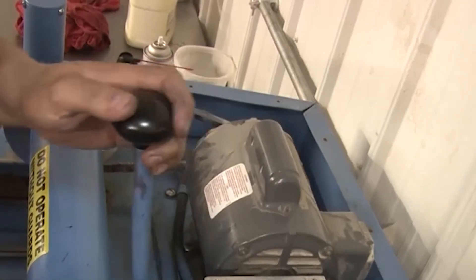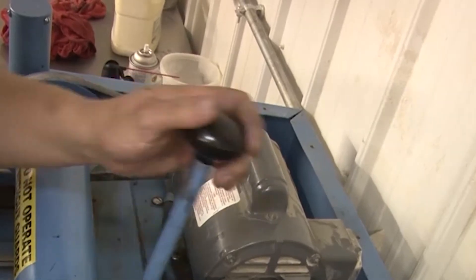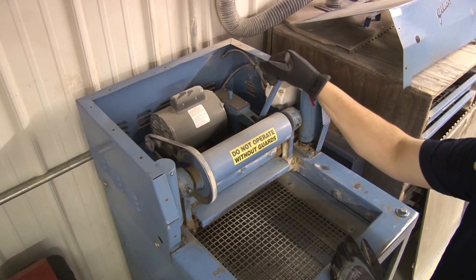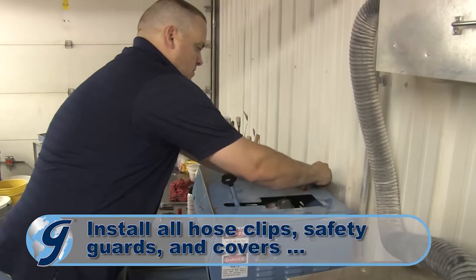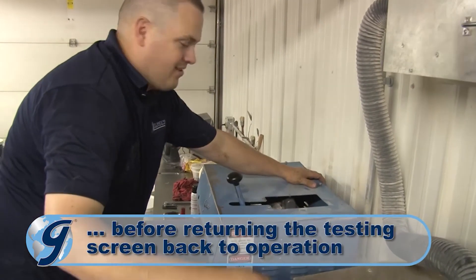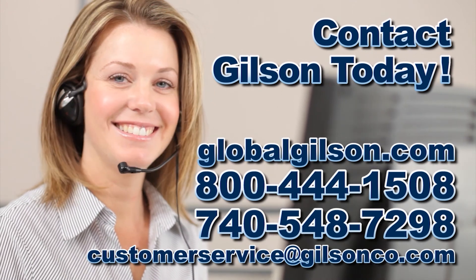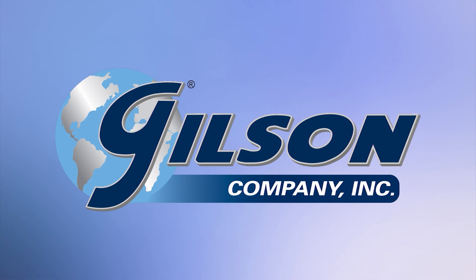Now pump the hydraulic system to full pressure again to complete a final check for any hydraulic fluid leaks. Once you have confirmed there are no leaks, pull the pump handle to release the trays. Finally, install all hose clips, safety guards, and covers before returning the unit to operation. For any questions concerning replacing the pump on your Gilson testing screen or for any Gilson product, please contact your Gilson technical support team.